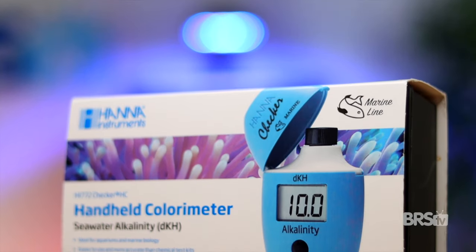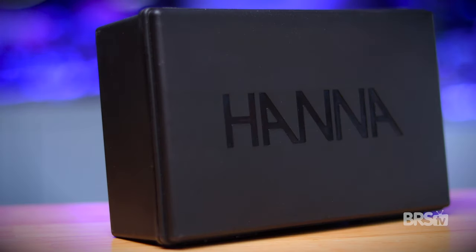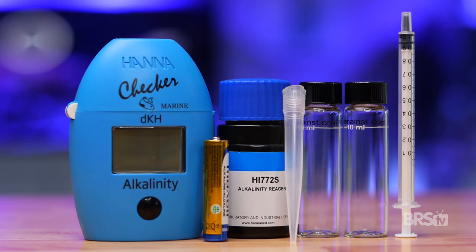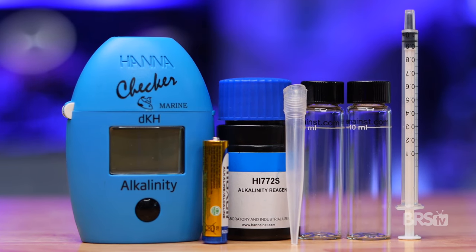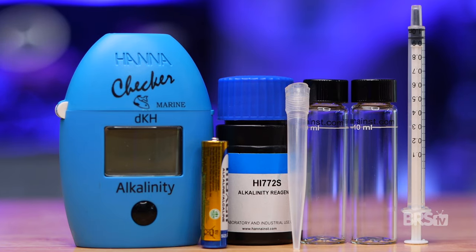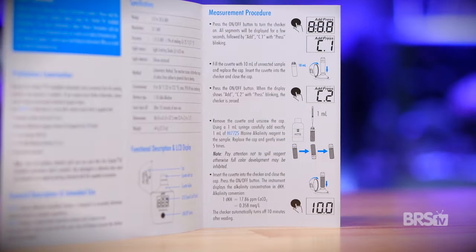How does Hanna accomplish this? Well, let's start by taking a peek at what's inside the box. The DKH Colorimeter comes with a plastic storage case, the checker itself, a AAA battery, a bottle of reagent good for 25 tests, a one milliliter plastic syringe and tip, two 10 milliliter cuvettes, an instruction manual, and a quick start guide.